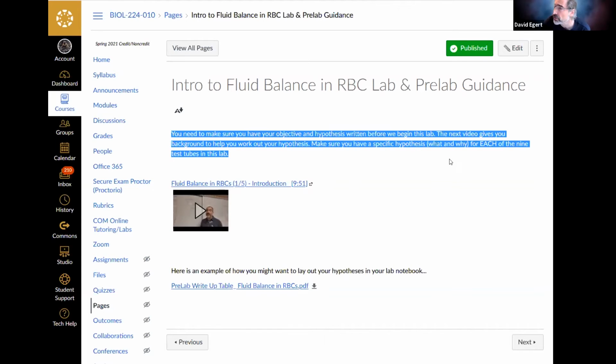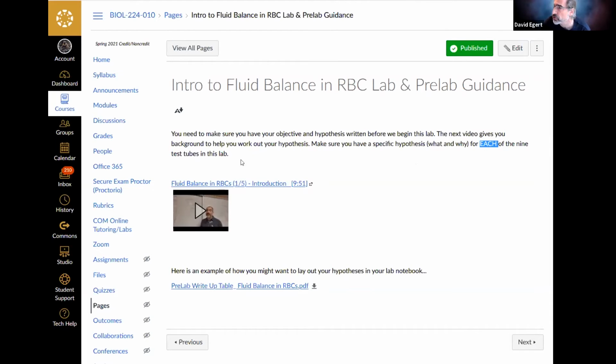It talks about, make sure you have a specific hypothesis for each of the 9 tubes in the lab. And then I have this little video here. I try to give you the background so you can work with this stuff. A lot of people did kind of bang up jobs on this, but some people really dropped the ball. So if you're one of them, you really do want to kind of up your game a little bit.